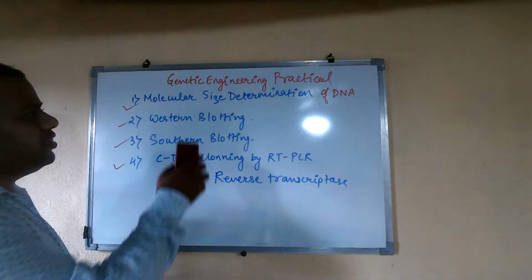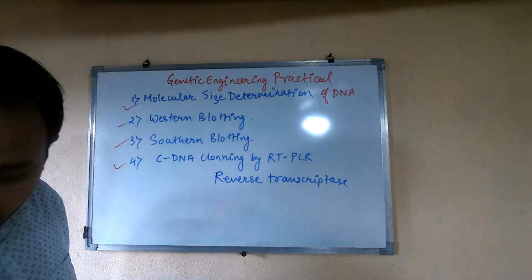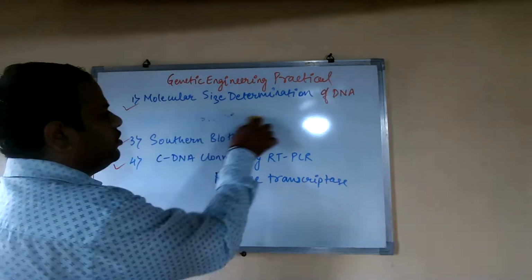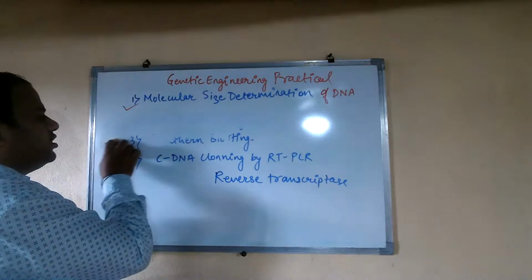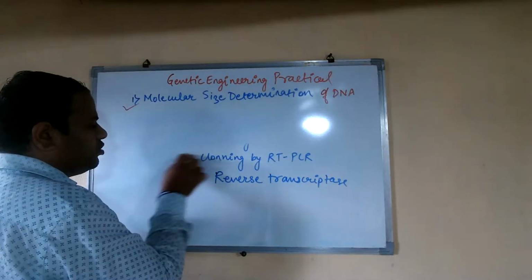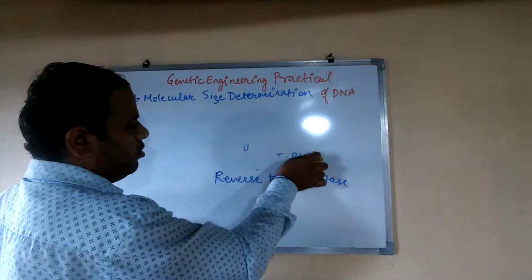The first practical that we are going to see is molecular size determination of DNA. Here in this practical, we are determining the size of DNA using a ladder.